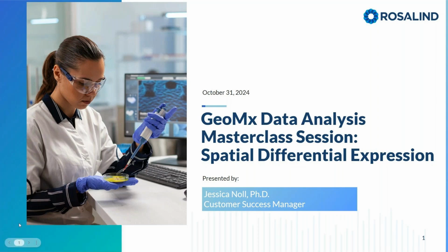So this is our last GeoMx data analysis masterclass session. Today we're going to be focusing on spatial differential expression.